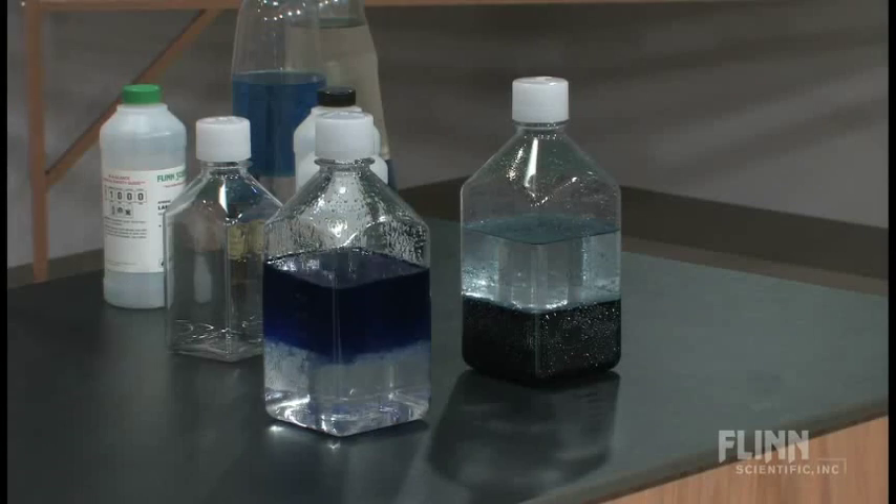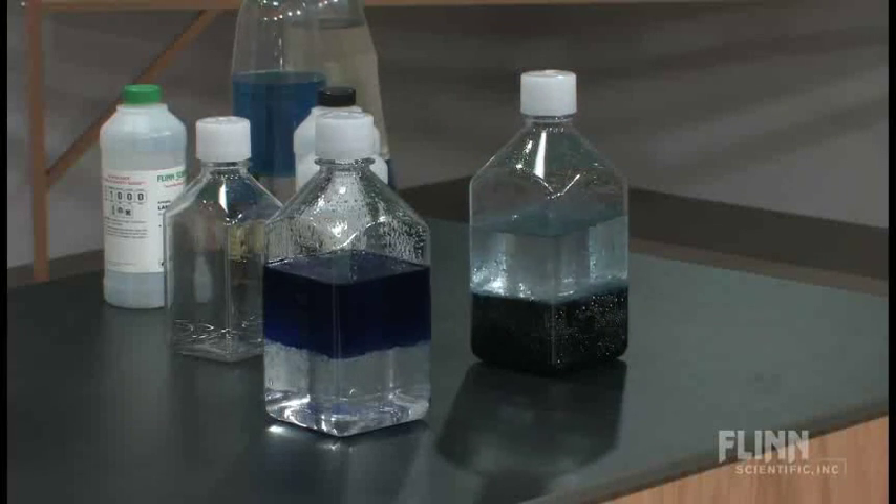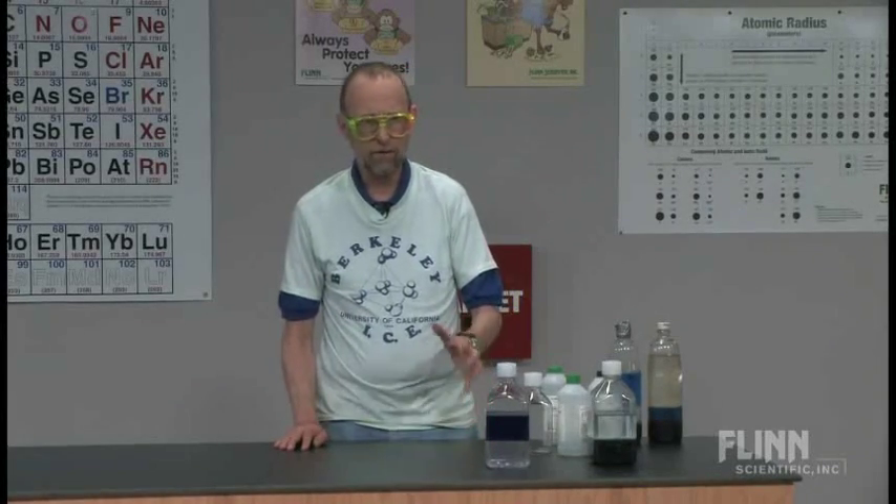That's nice. You're going to get some interface problems, but that's kind of nice. You could do the same thing I've done with mine for the last 30 years. So two uses: one, density, and two, bonding — polar, non-polar, likes dissolving likes, et cetera. Thank you.